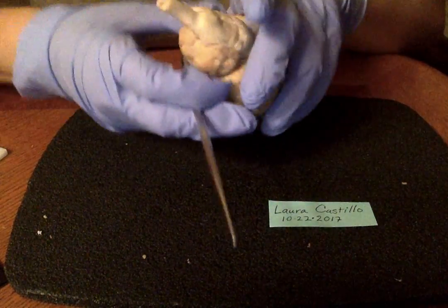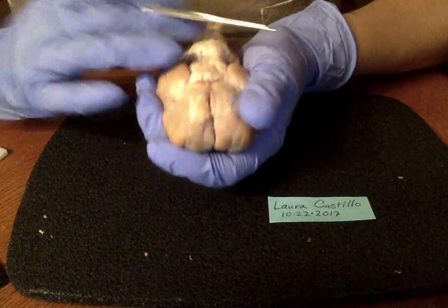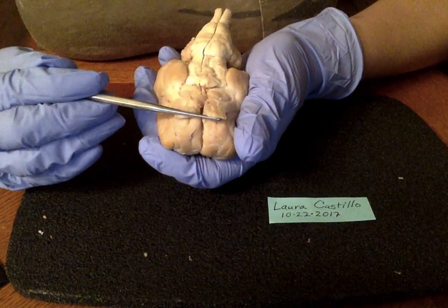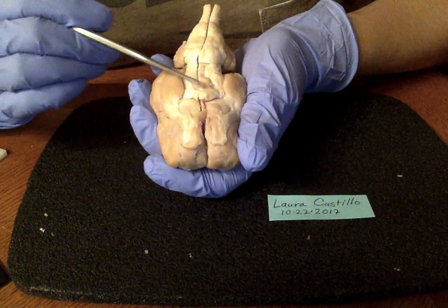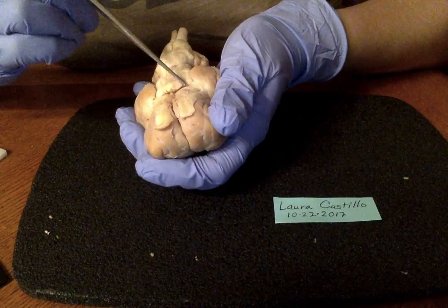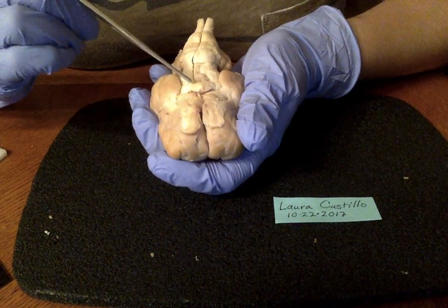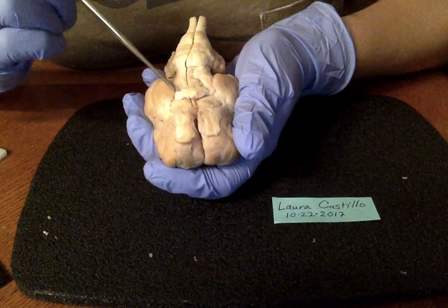We'll talk about the olfactory bulbs, which are these guys here. Then we have the optic chiasma, which is going to be right here. Optic nerves can be seen right here, so that's one of the nerves. You can't really see this one too well, but those are your optic nerves. Then you have your optic tracts, which are these longer structures here.